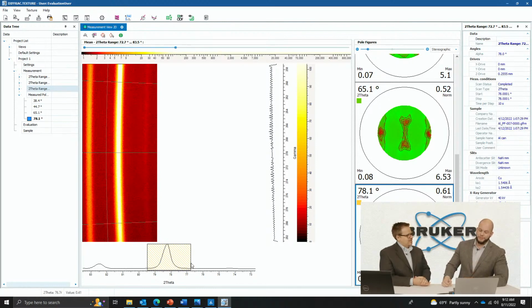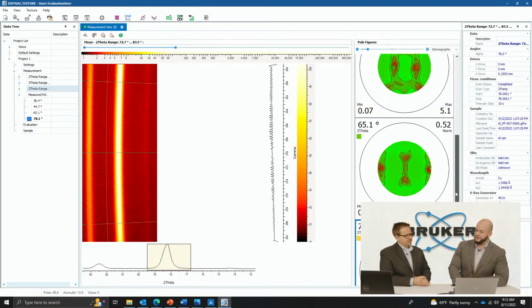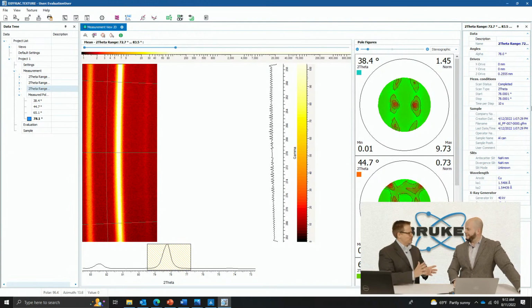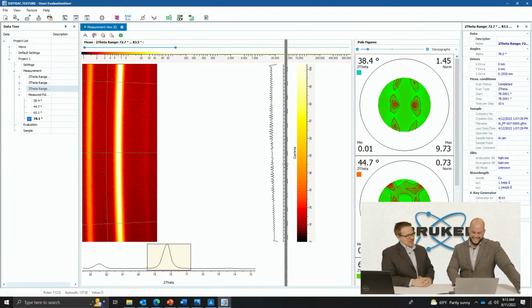One thing I don't know if I mentioned already is that this is an aluminum soda can that I've just cut up. We're looking at the sides of the can. So this has gone through many cold rolling, stamping and punching processes, which can certainly affect the preferred orientation in the sample. This is just a regular old soda can, cut out of the side. Anybody can get a sample. If anybody back in their lab wants to try this out too, just get a soda can. Maybe you can expense that. Now you've got a perfect sample to follow along.